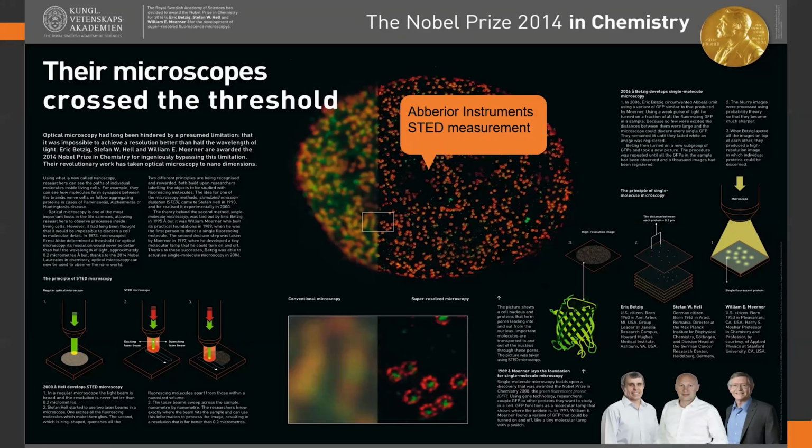It can show the 8 subunits clearly in the XY view, while the green protein is the central protein of the nuclear pore complex. And actually, here it is just 2D. We know from the 3D that the central protein is underneath, right? It's in the inner part of the nuclear membrane, while the 8 subunits are sitting across the membrane. So you also have to keep in mind that 3D is important.